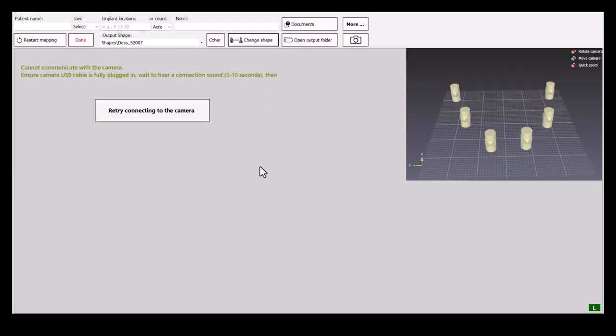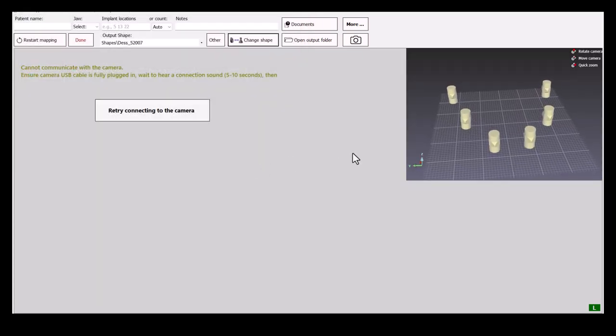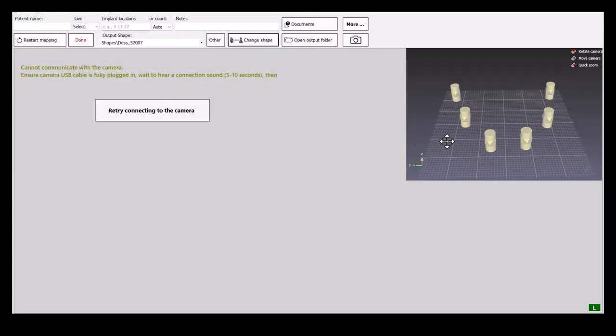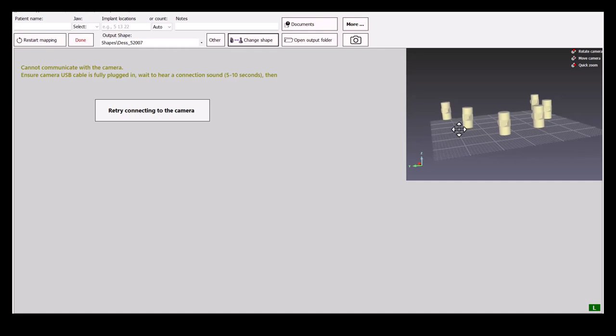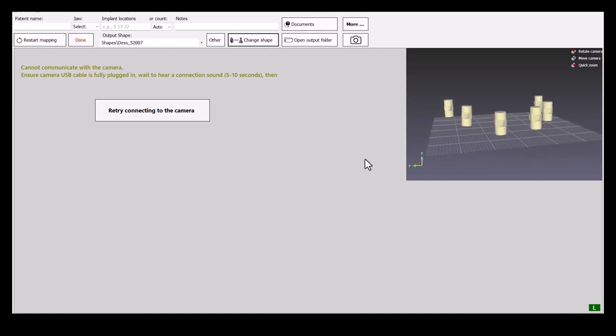Once opened, you can see that the output shape is now changed and saved in the scan directory.